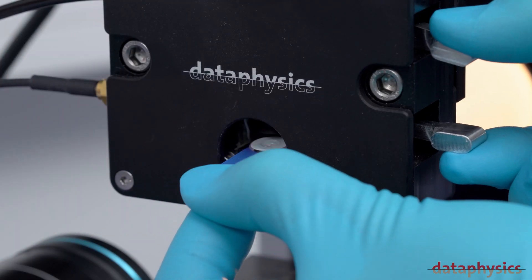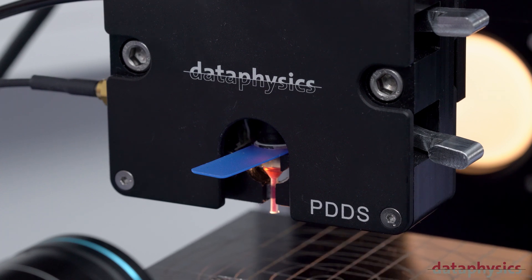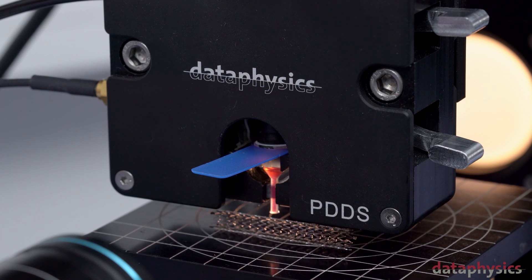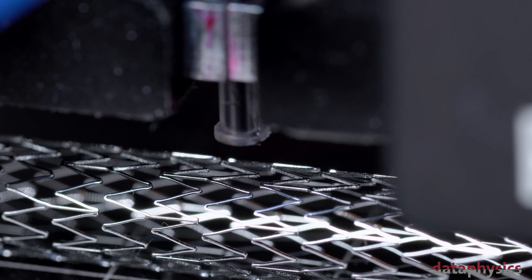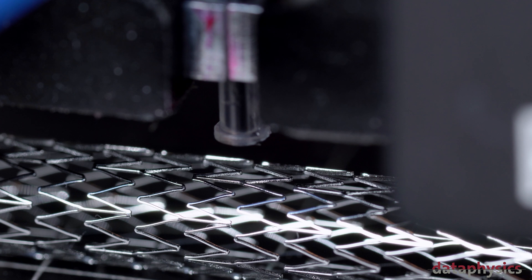The liquid-filled cartridge can be inserted into the dosing head very simply and without effort. With the motorized sample stage of the optical contact angle measuring system, the sample can be positioned precisely under the cartridge nozzle.